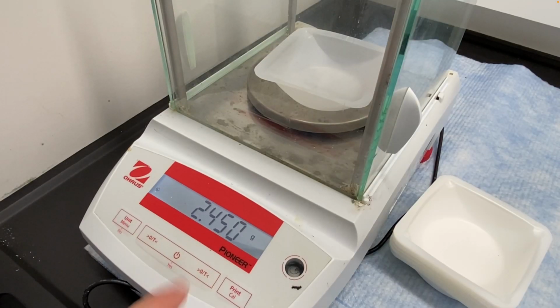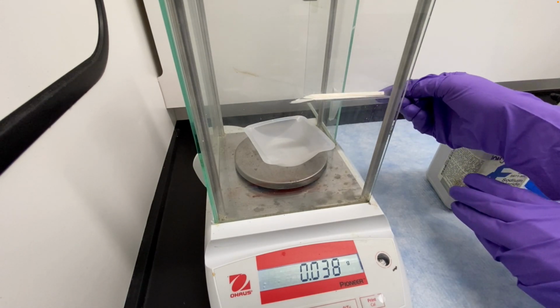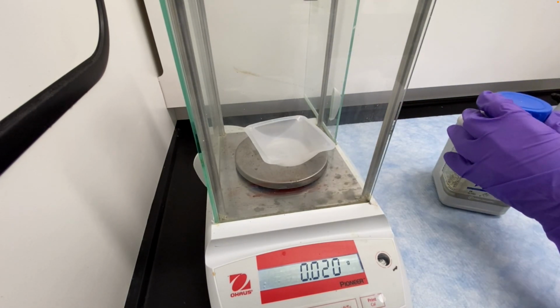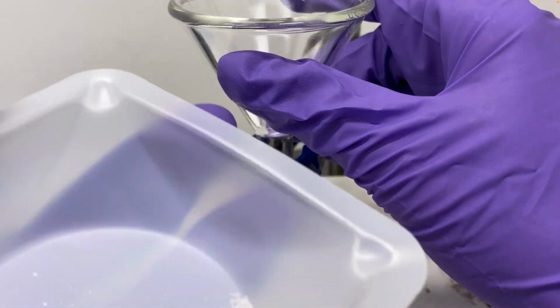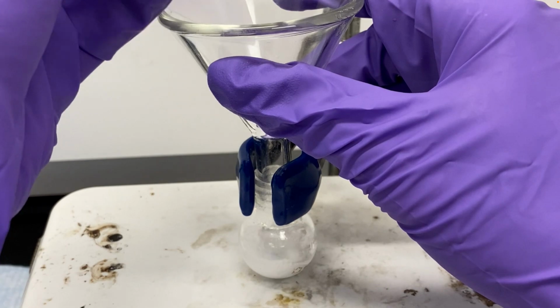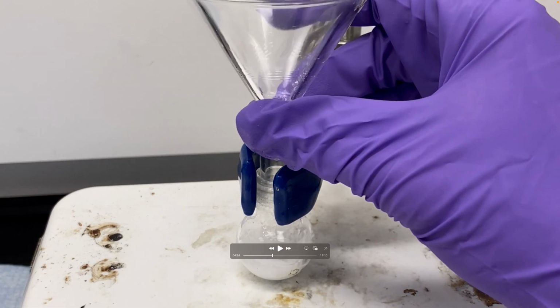Procedure is the same. Weighing boat on the balance, tare it, shake out just a tiny amount of your solid. Powder funnel, bend the weighing boat so that a corner becomes a spout, pour it into the funnel. One error I will sometimes see with students with this is they will lower the stem of the funnel all the way into their reaction mixture. Of course, you never want to do that. You can contaminate your reaction mixture, and also some of it is going to stick to the powder funnel, so you'll lower your yield.